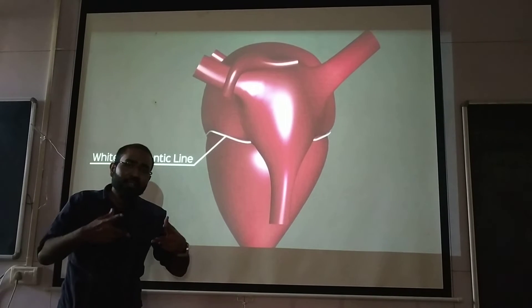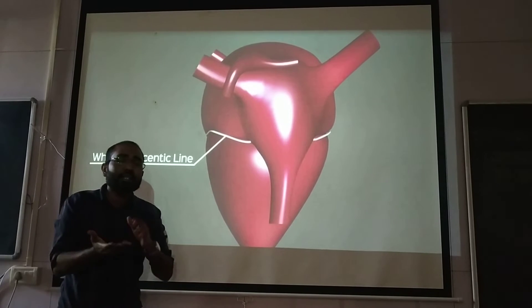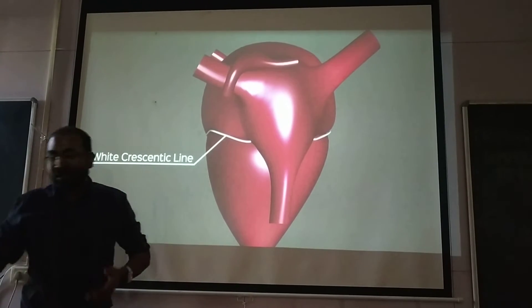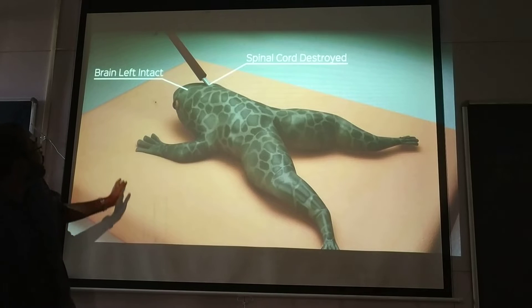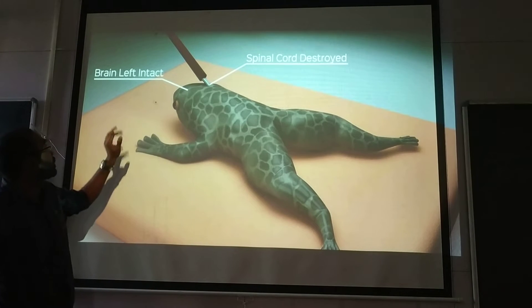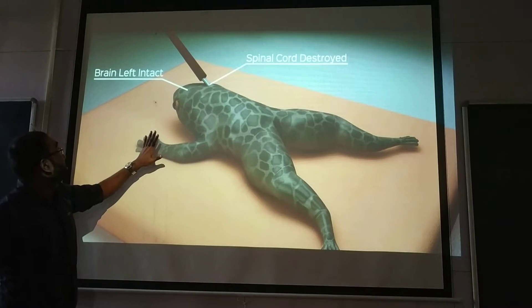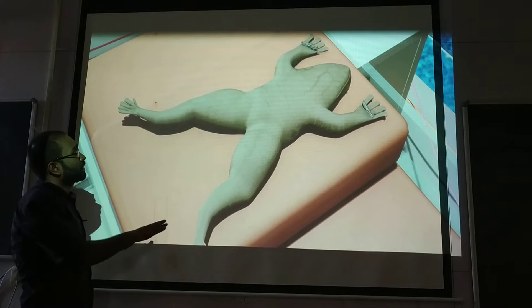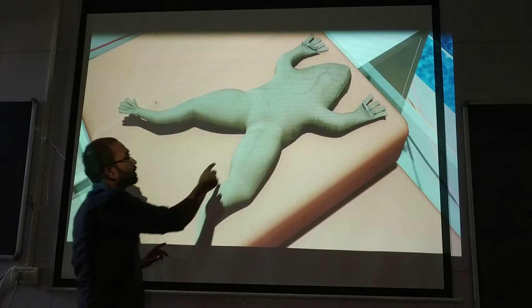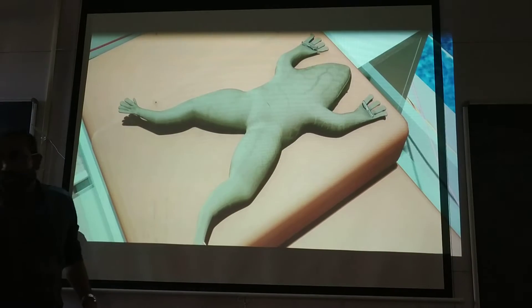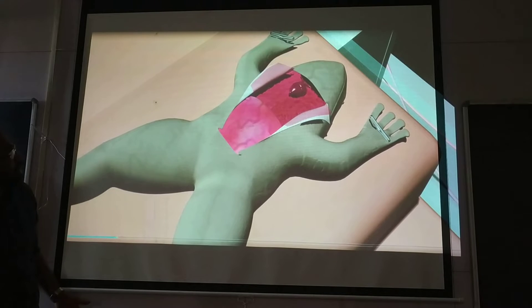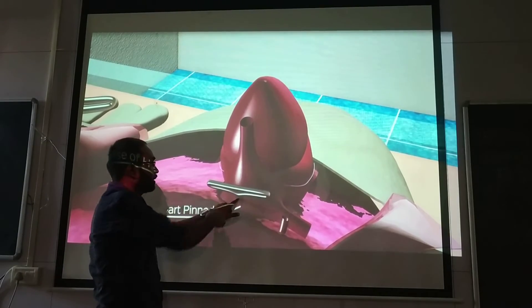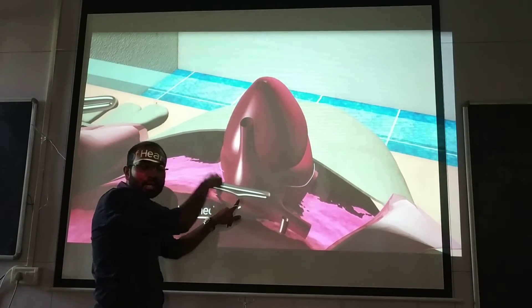Now we will start with how we basically dissect the frog — how we dissect the heart, open the pericardium, and take the recording. The frog has its spinal cord destroyed and is placed in the supine position. We cut the thorax and open the heart. The base of the heart is then pinned to hold it in place.